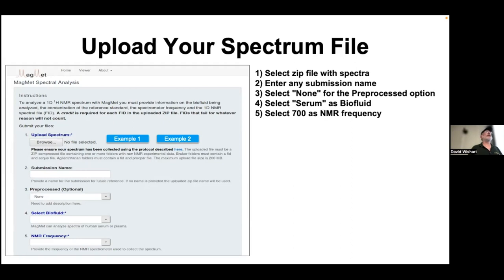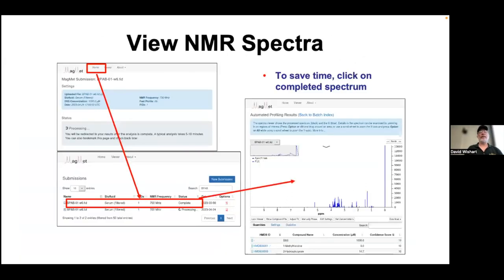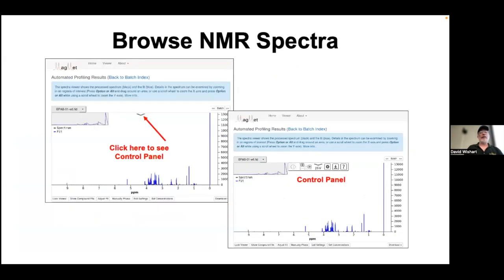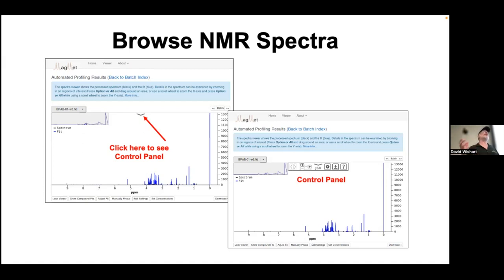Just take the default options — it should have chosen DSS as the chemical shift reference. Once it's completed, click on it and it'll pop up your spectrum. You can explore it using a control panel accessible via the big down arrow. This uses a tool called JSpectraView — a JavaScript tool developed in the lab that allows you to interactively view NMR, GCMS, and LCMS spectra on the web.